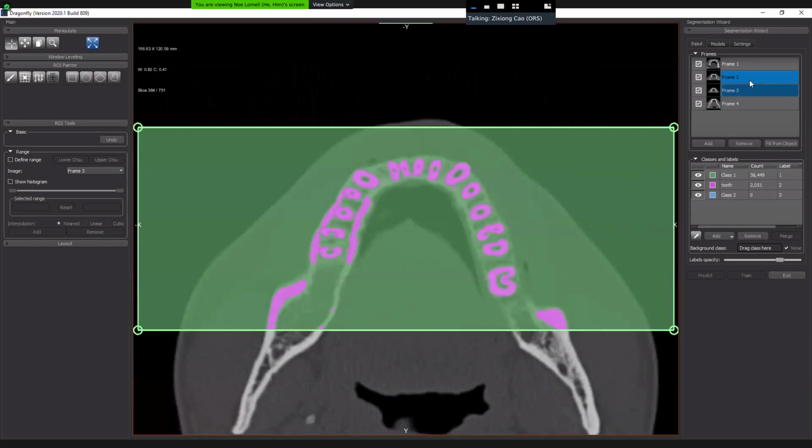Okay, so now it's time to retrain. We can do it here. You see now, this should be the bone. I can double... Oh, you want me to change the name? No, it's fine. You could change the name, but it's okay. It's not my point now.